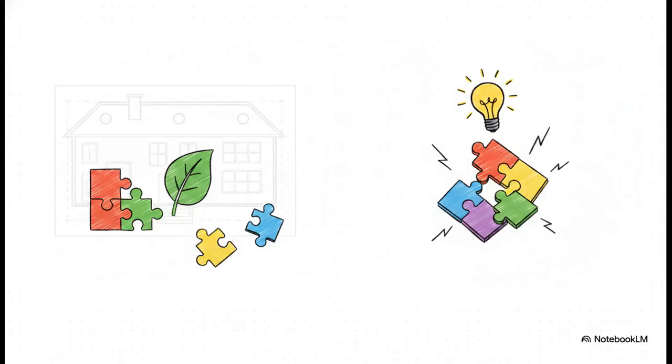If we already have a master copy of the instruction manual, like the standard human genome, we use what's called reference-based alignment, using software like the popular Tuxedo suite. It's exactly like putting together a jigsaw puzzle while looking at the picture on the box. But what if we're studying some totally new, unsequenced organism? We don't have a box cover. In that case, we build it completely from scratch using de novo assembly tools, like Trinity. We literally just look for pieces that happen to overlap and slowly build the picture completely blind.